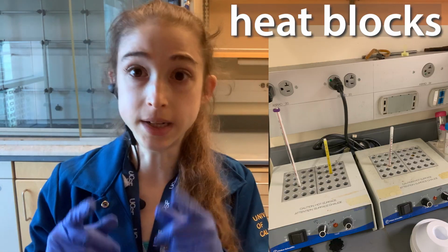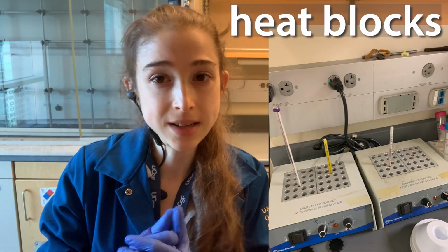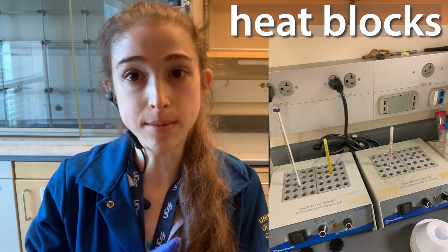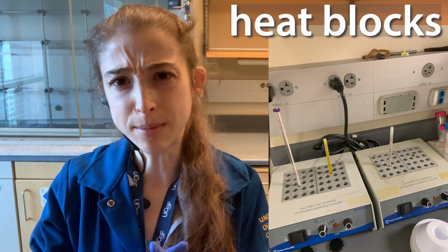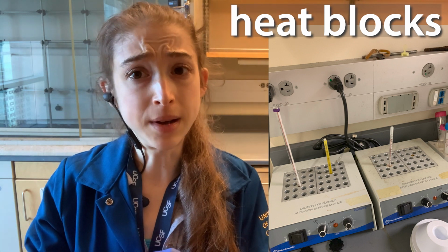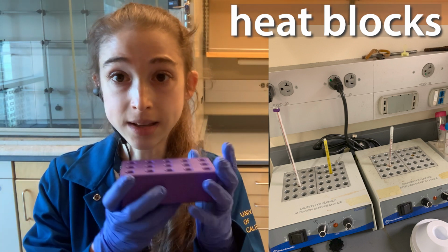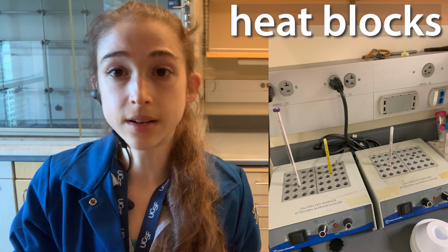Heat blocks are like a thermal shaker, but it doesn't shake. Basically, we just have these heat blocks. Some of the fancy newer ones are digital, which is nice, because I'm guessing they keep the temperature a little better. But then we also have heat blocks that basically look like a metal block in a tub of sand.